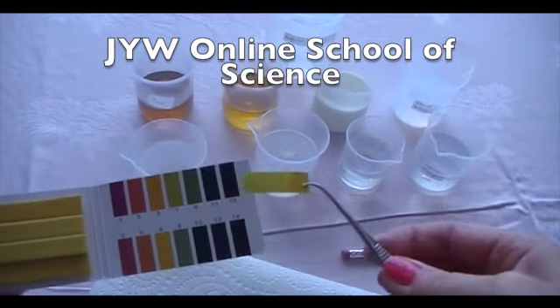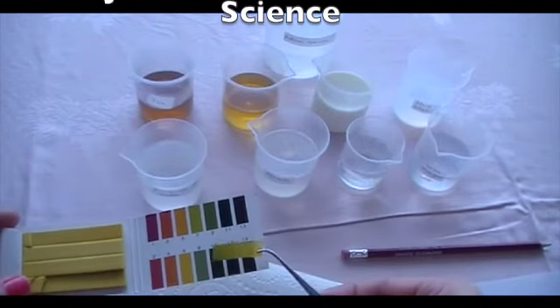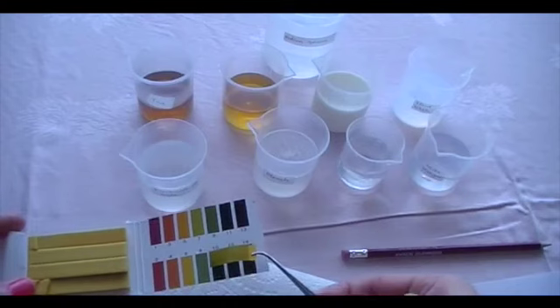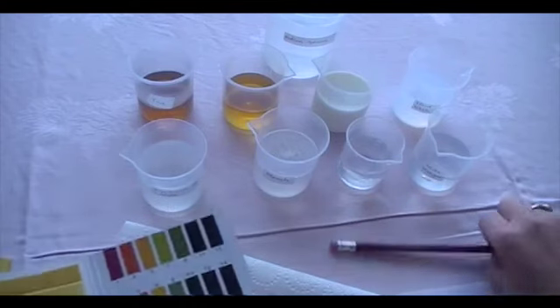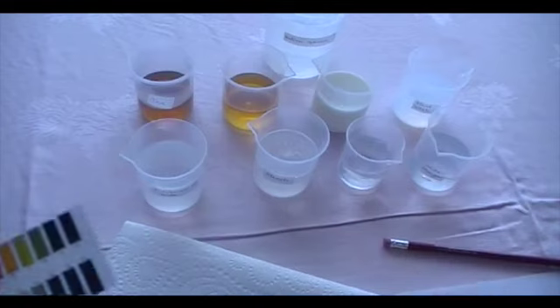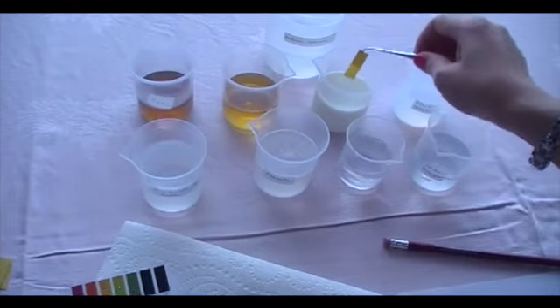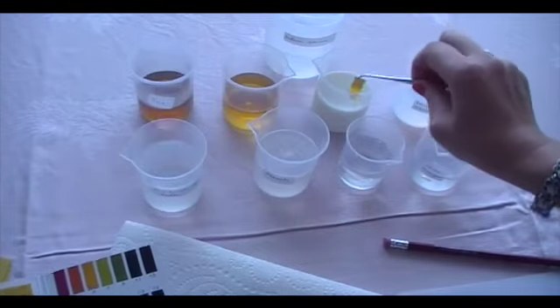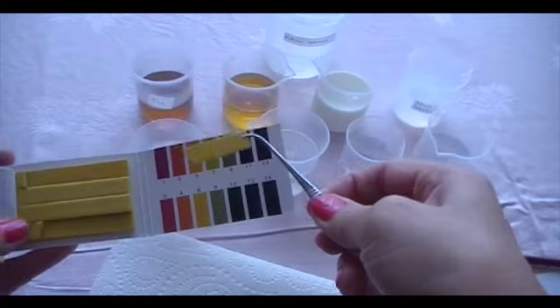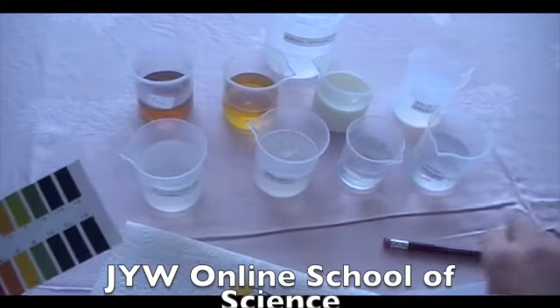See the color? Hand wash is very close to pH 8. Hand wash, pH 8. And I also have got milk here. See the milk? pH 7.